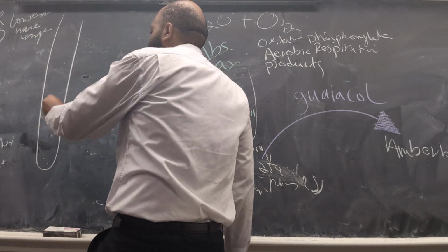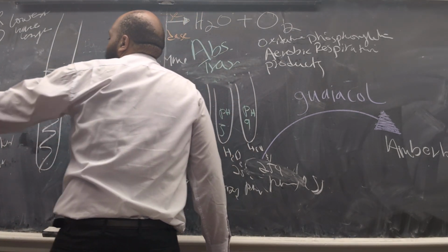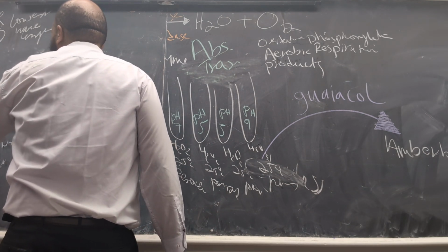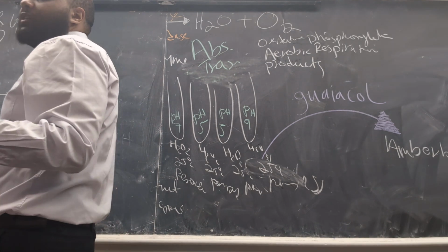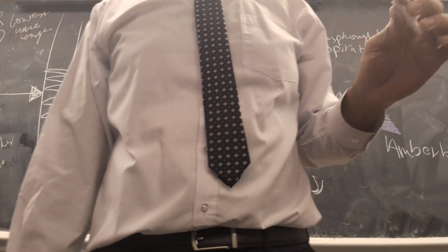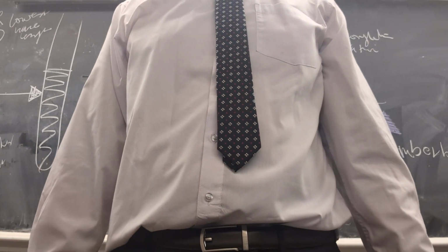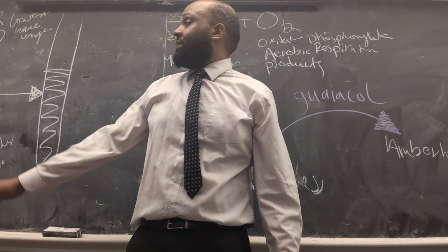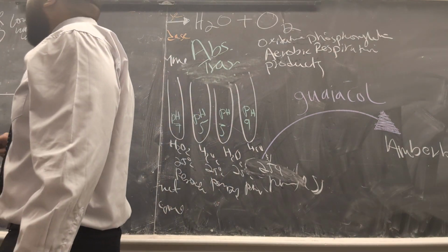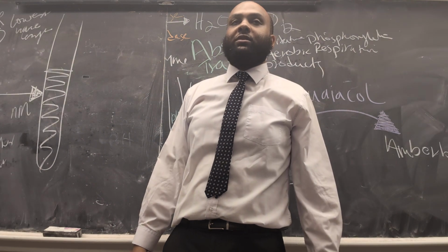And then we're going to appoint a light. What is the light that we designated for this experiment? What is the wavelength of light that was designated to be used in this experiment? How many nanometers are we going to put on the spectrophotometer to project the light onward into our test sample?